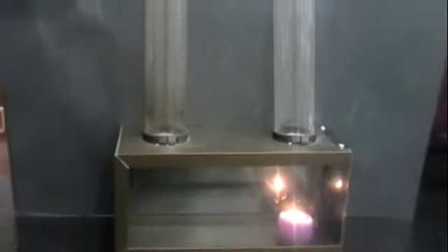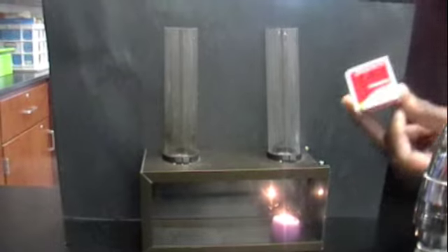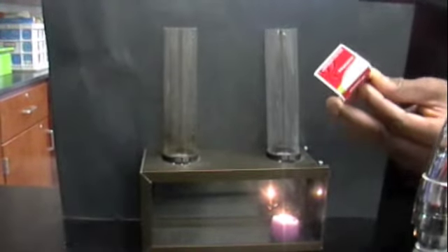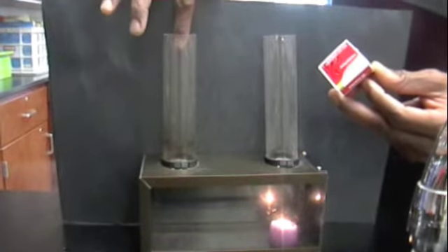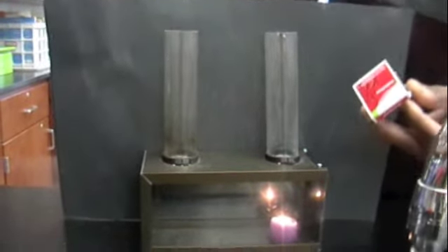Okay, so the candle is lit. Now what I'm going to do is take a book of matches, and I'm going to ignite the entire book. I'm going to blow it out and then insert the blown out matches into this column and observe what happens.